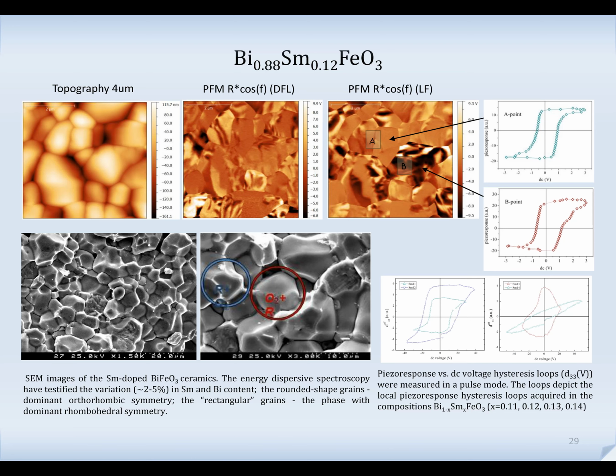And probably when we have really small grains, during polishing you average and smear or diffuse, so you read some average signal from different grains. So I would say it's a question of experiment, not because of the material.